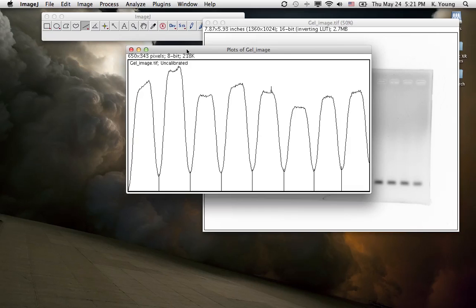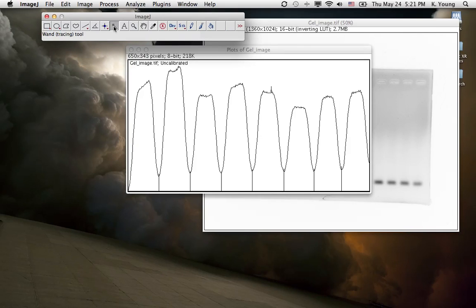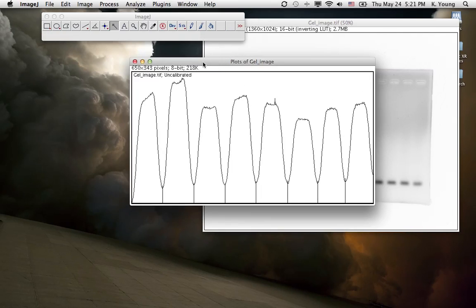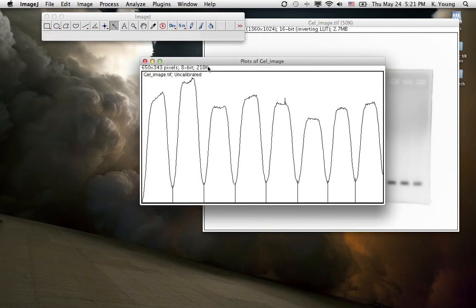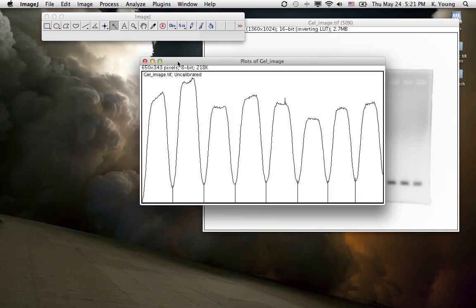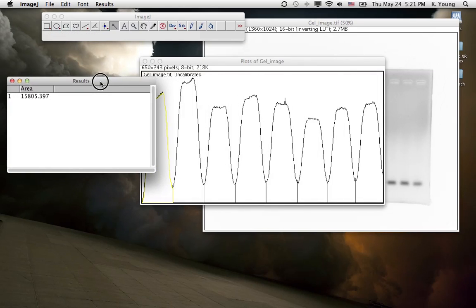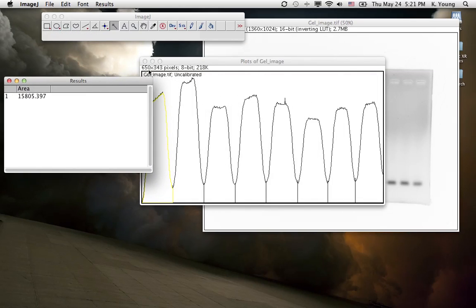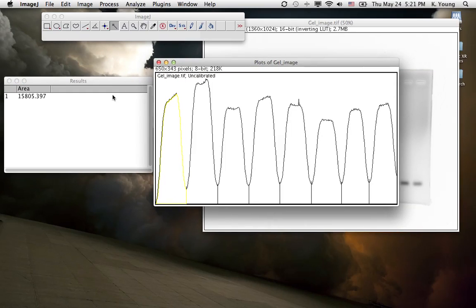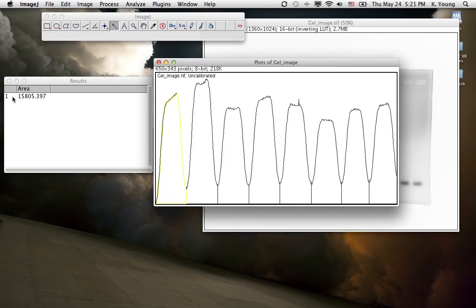Once we have that done, what we want to do is go to the wand tool, wand tracing tool, and we're going to assign each peak a value, an area value. So click on that, then click on the first peak, and you see this pop up right here in the results box.